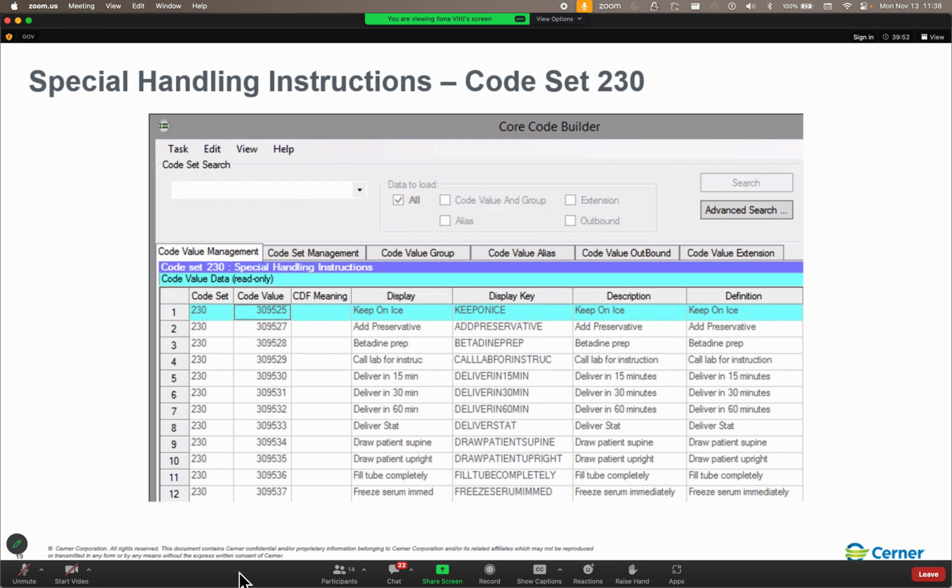Now below that on the accession assignment, how far in the future can you place an order to be collected and still let it get an accession number? Well, in this case, 1,825 days. So that's 5+ years from now? My question is, why are you placing an order now to be collected in 2 years, 3 years, 4 years, 5 years? So I would have a question about that.